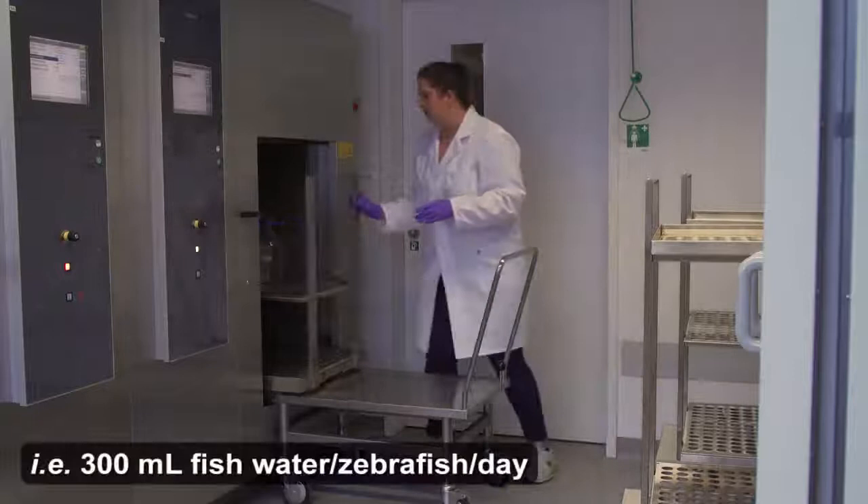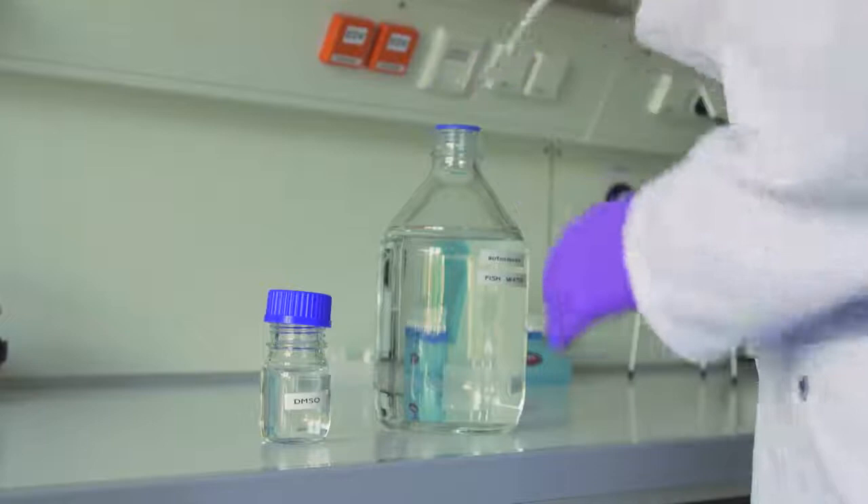Before beginning the procedure, autoclave one aluminum foil-covered 600ml beaker per zebrafish and an appropriate number of glass bottles of fish water for the experiment, and prepare the immunosuppressive drug and experimental control solutions of interest.